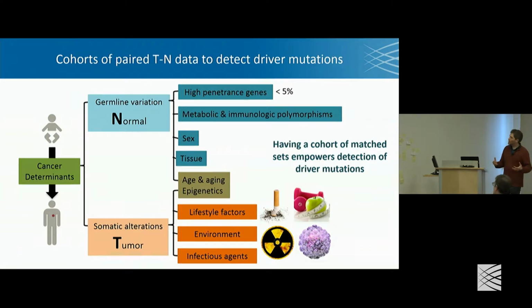So a somatic alteration would be only in one subpopulation of your cells. So in germline, you often have these large cohorts to help give you statistical power. In cancer, typically, if you are presented with one tumor normal pair, you would use other studies to determine, well, is this a common mutation that I see in cancer?